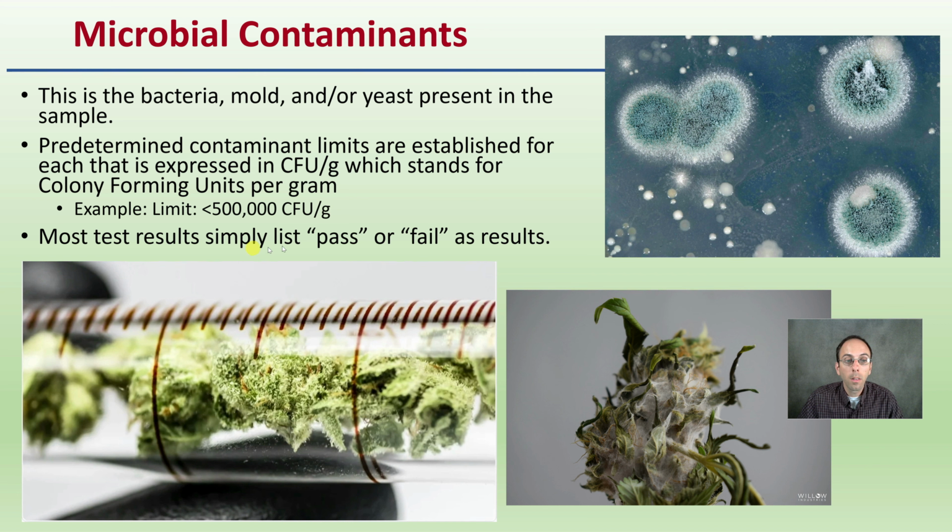Most test results simply list pass or fail as a result, meaning were they below or above that threshold. If they were above that threshold, it would be a failing test, and if they were below that threshold, they'd be getting a passing mark there. And keep in mind that just because the sample looks clean doesn't necessarily mean it will still pass one of these microbial tests or analyses.